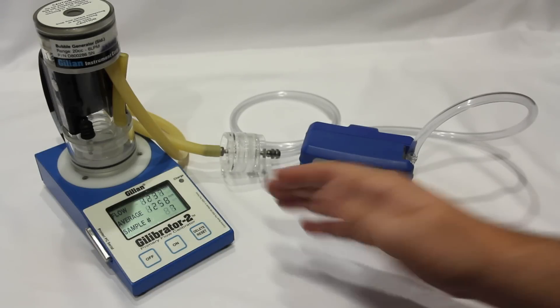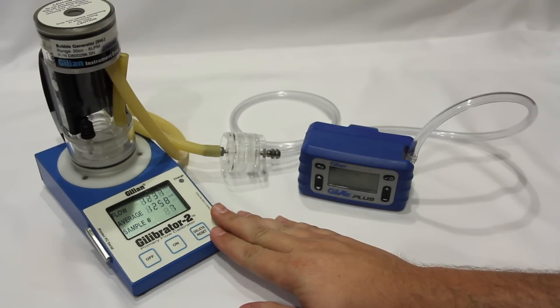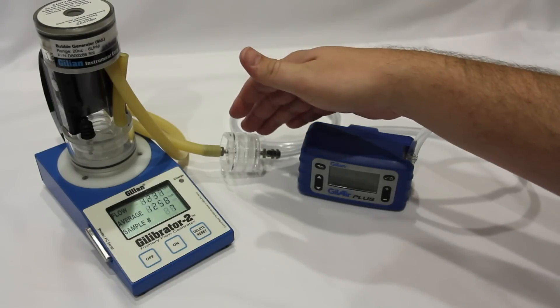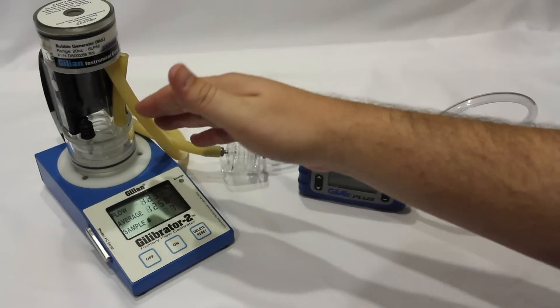To begin calibrating, set up the airflow calibrator per the manufacturer's instructions. Ensure that your sampling media is in line between the air sampling pump and the calibrator.